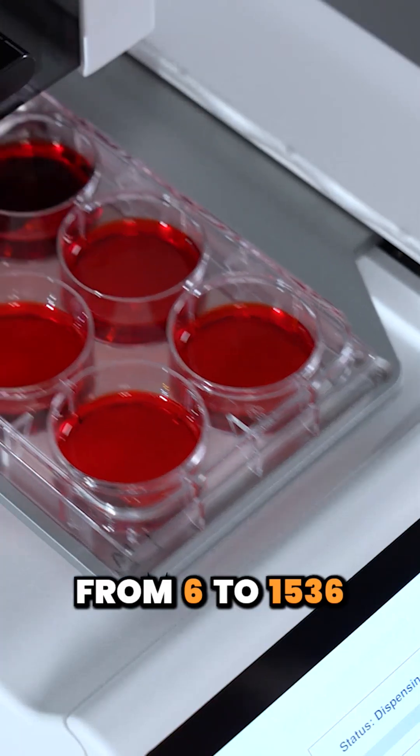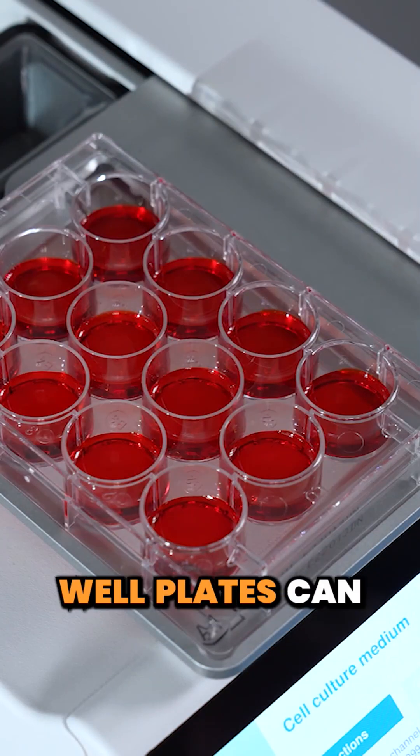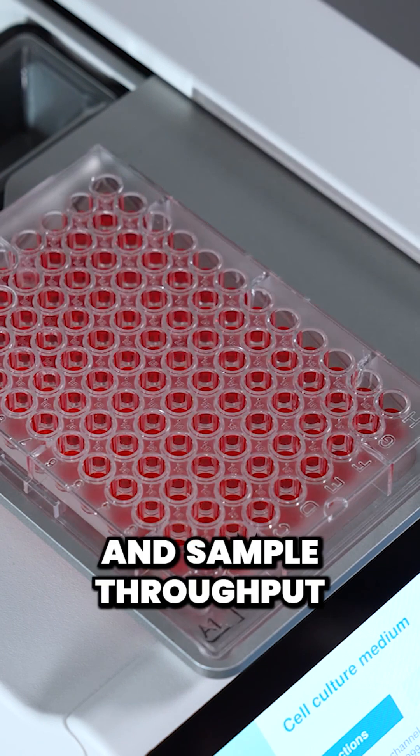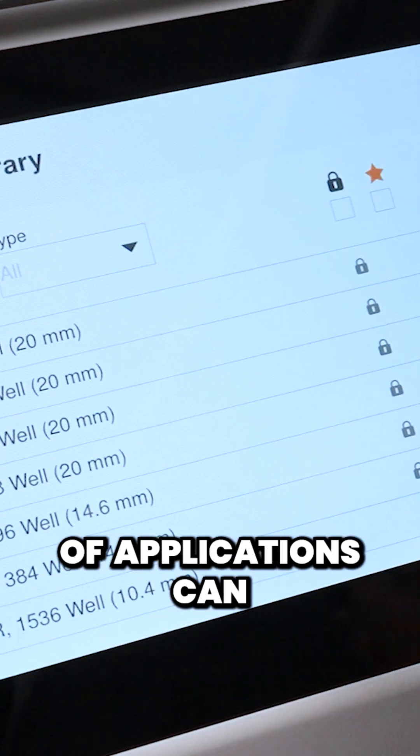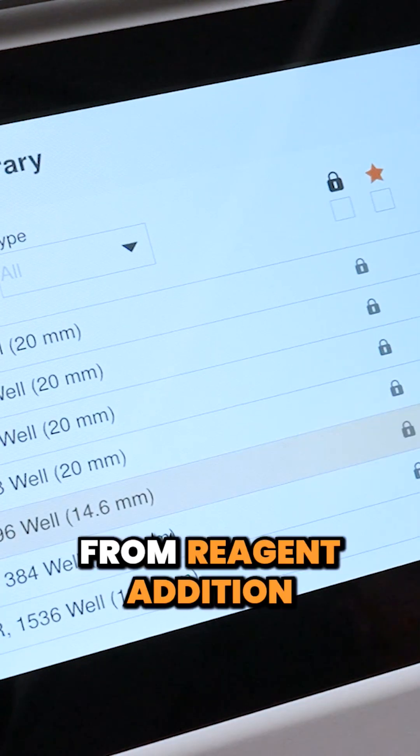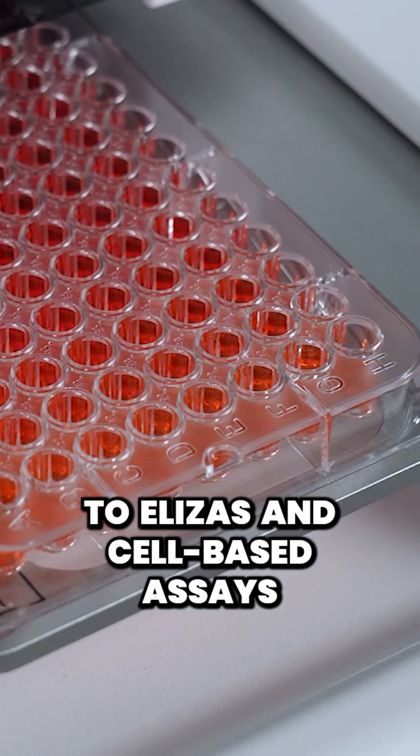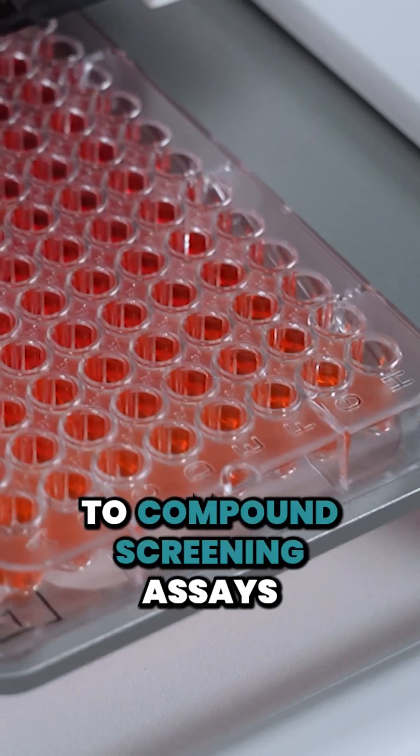Any plate format from 6 to 1536 well plates can be handled on both units, depending on your application and sample throughput. Just choose your plate type and a vast number of applications can be supported by the system, from reagent addition to ELISA and cell-based assays to compound screening assays.